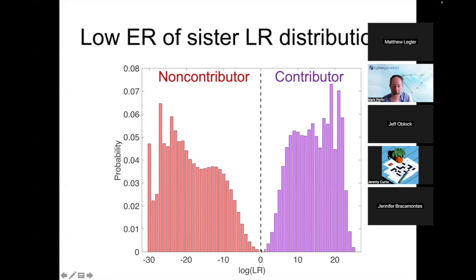You could point to that, Matt. And because the error rate is so low from the non-contributors, we have very high statistical confidence that we're not falsely reporting contributors.